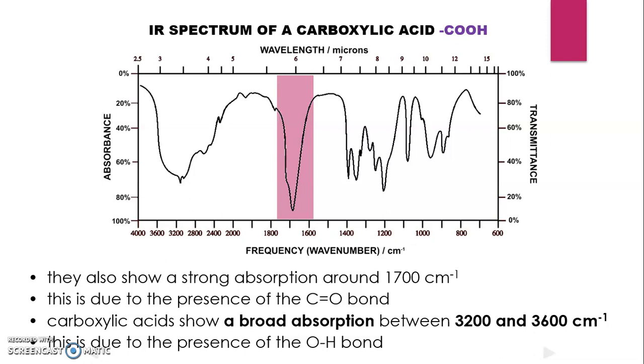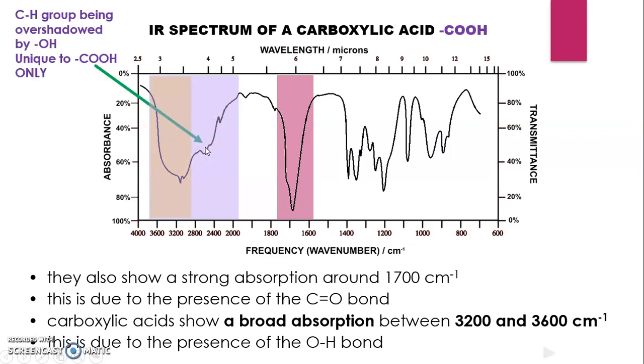But that's not unique enough. What's even more is that notice that there seems to be a merging of two absorptions here, right? It seems that there were two peaks here, and they sort of merged. So the carbon-hydrogen absorption band, in the spectrum of a carboxylic acid, is often overshadowed by the hydroxyl group here.